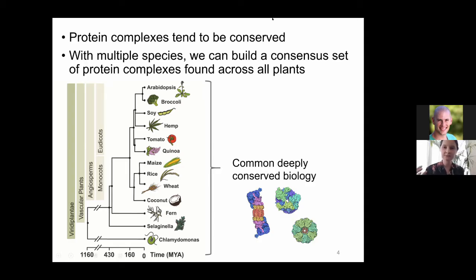Then we can take each well and do mass spectrometry to determine what proteins are in each well. The advantages of this technique, especially for plants, are that you don't need any type of affinity tagging or antibodies. You can apply it to pretty much any organism and any sample, with a little asterisk on that: there are some samples, like coral, where it seems to not work that great.